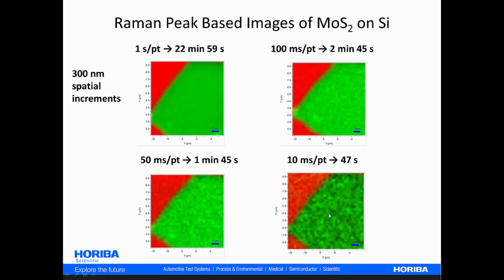And that's the important thing to remember here, is that when performing imaging based on, say, a single spectral peak or two adjacent peaks, as we have done today, then more so than ever, the quality of your image and the contrast of your image, the signal to noise of your image, is really based upon the signal to noise of your spectra.